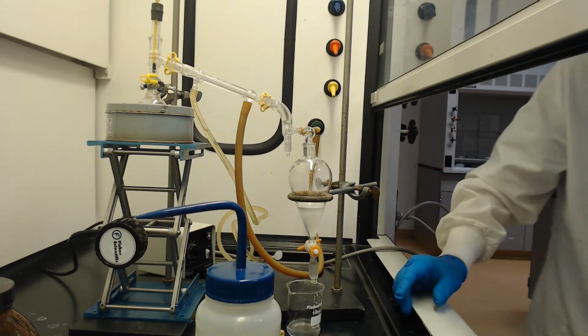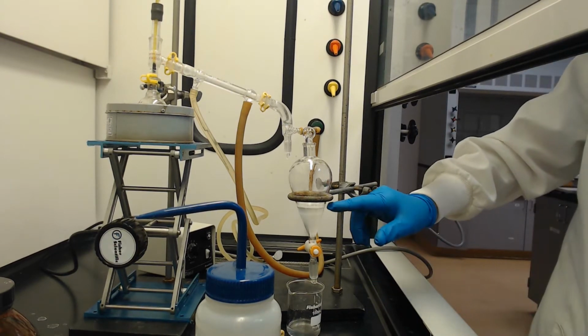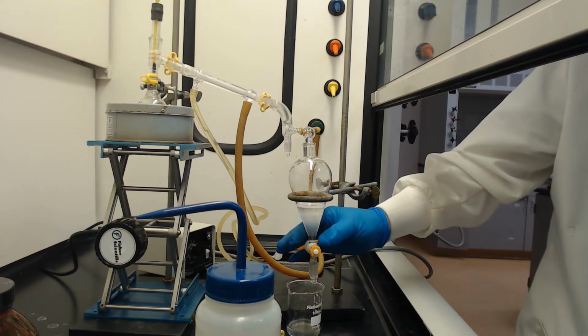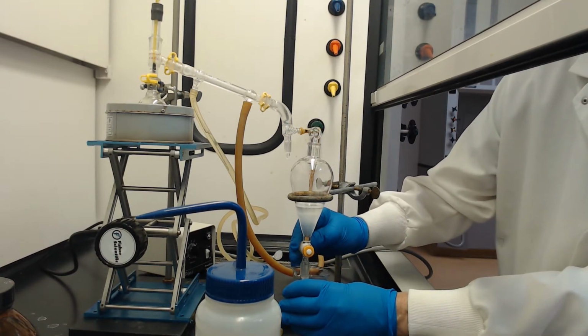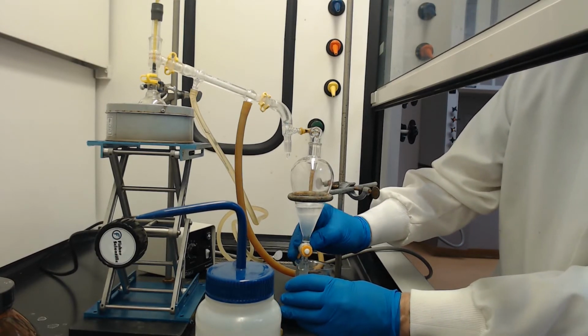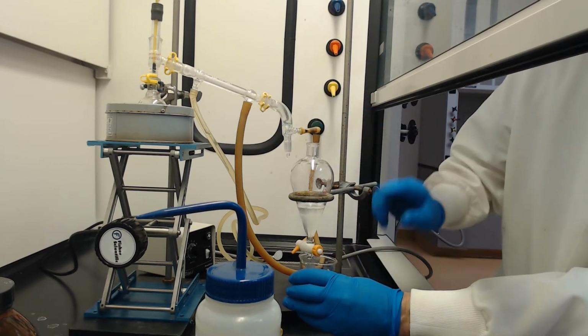The top layer still looks a little cloudy. It's clearing up a little bit, but it's still pretty wet. So that's why it's cloudy, because there's water in there suspended. Most of the water is down here. We'll take that off, join it with the other water that we'll eventually discard. And so what am I not doing? I need to take this off, otherwise we get a pressure and it won't drain.